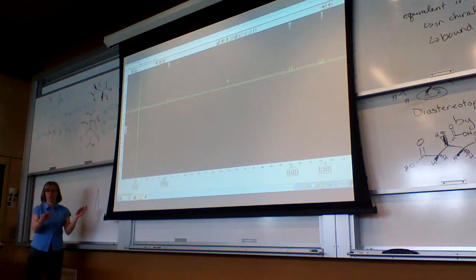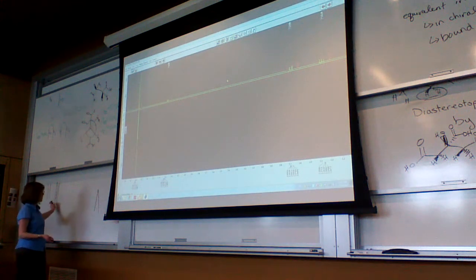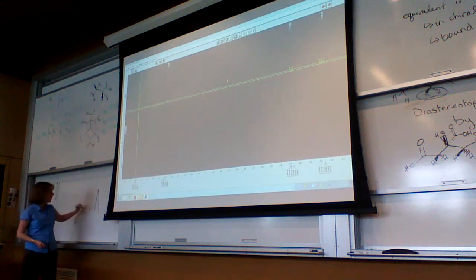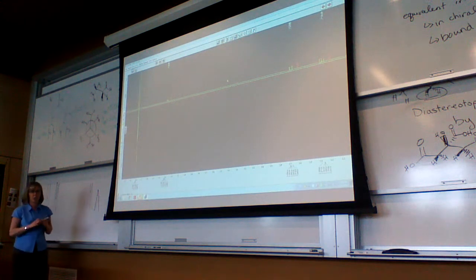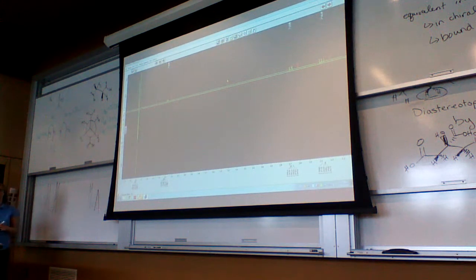If it's a nice sharp signal, then it is likely that this is good because the shimming affects all the way across. But if it has that same kind of pattern, it's probably just due to bad shimming. Okay. That makes your life more difficult. It's possible to interpret.